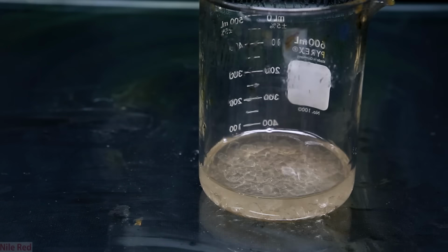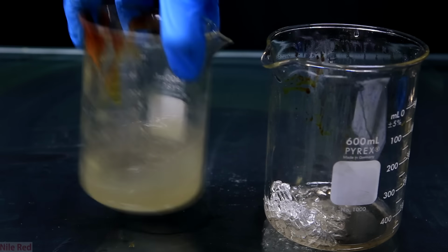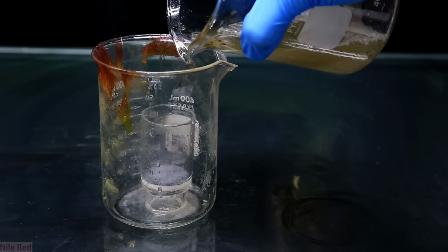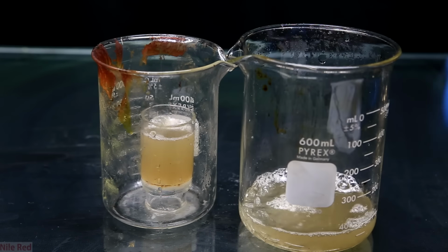In either case, we're converting the iodine back into sodium iodide, which is colorless and water soluble. So I use this concentrated sodium thiosulfate solution to wash out all of my beakers, and it works very well. I pour some into the filter that I use that still had some iodine on it, and you can see immediately the purple color disappears.